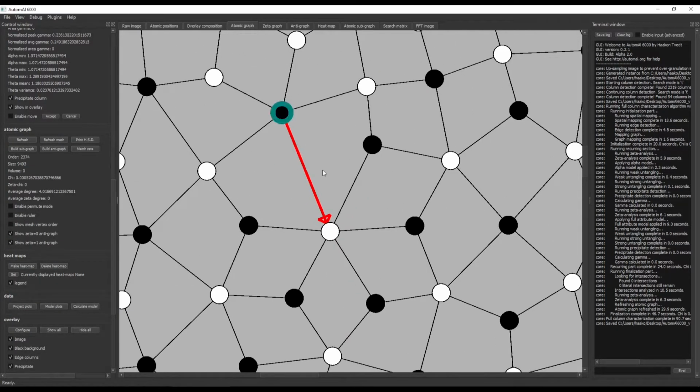And this is in fact an exception from the principles we were talking about earlier, because you see this one here is correctly assuming this to be its opposite plane nearest neighbor, but this is not reciprocated. Why? Because this magnesium allegedly has 1, 2, 3, 4, 5, 6 opposite plane nearest neighbors, but I said that magnesium should have 5.